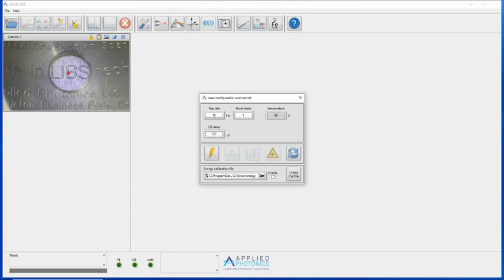This configuration window provides a set of buttons for manually controlling the laser, which are useful when testing and configuring it. These are start/stop the flash lamp, pulse the laser, so fire a single shot, fire a burst of shots, and start/stop continuous firing. To the right of these controls there is a further button to reinitialize the laser. There should be no need to use this button unless for some reason there is a communications failure between the computer and the laser.